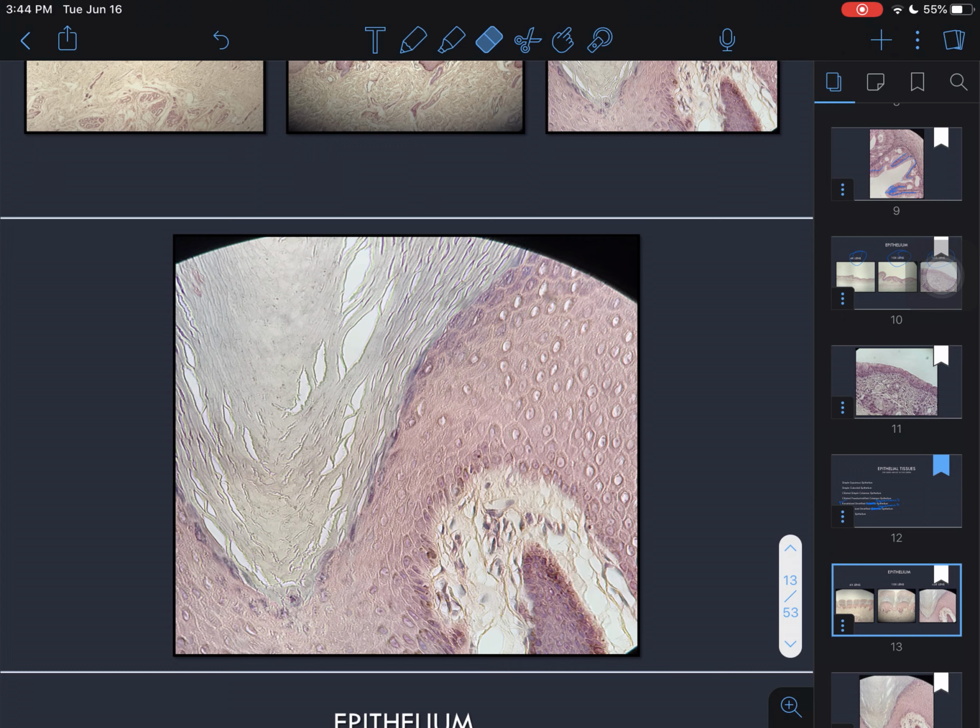So if you'll notice all the way down here, right, you see all of these guys. And notice they're kind of rangy in how their cell membranes look, okay? Notice they get less clear as they move towards the apical side, right? Less and less clear, and that's because the cells themselves are dying.